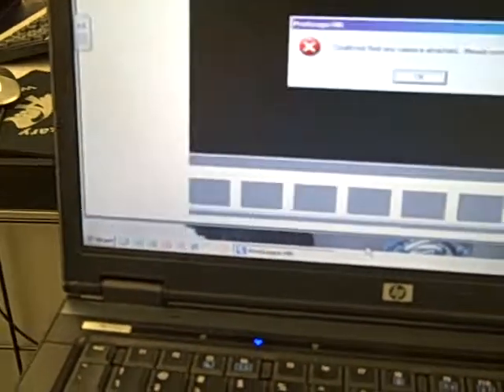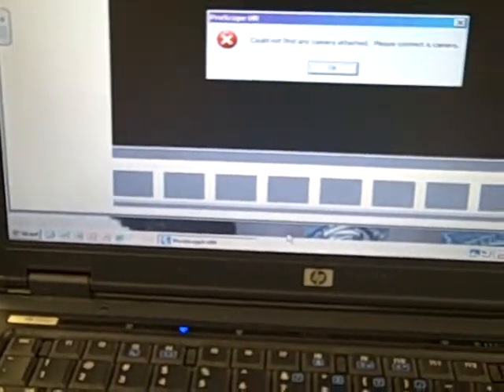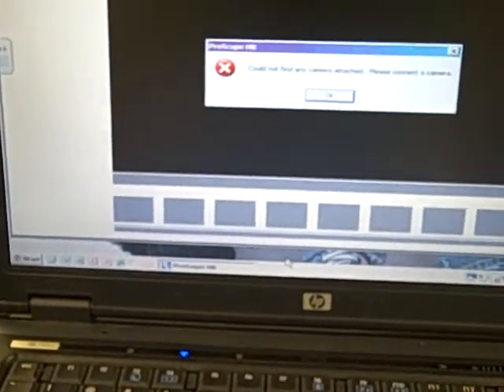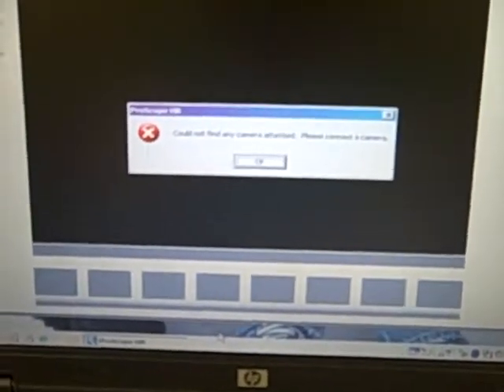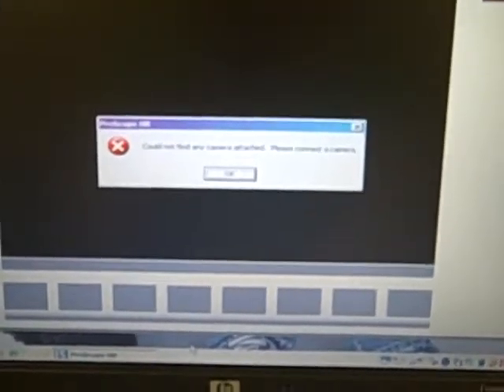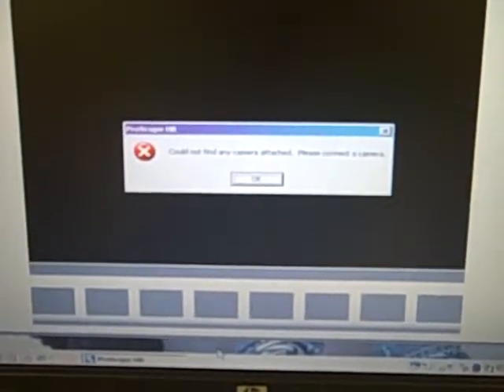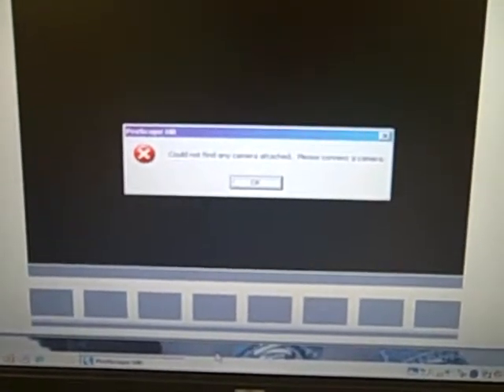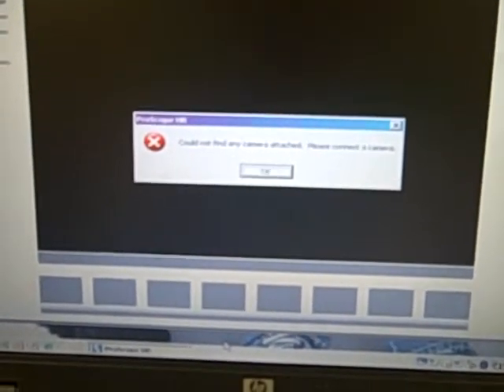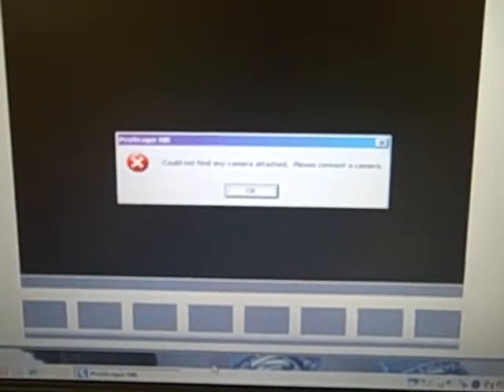At this point, if you get an error, come see me. The one that just popped up right now on mine is could not find any camera attached, please connect a camera. That's a simple thing, just connecting a camera. If your error says something that you need to download Windows Service Pack, email Katie, and I will give you the really quick attachment that you need to run this. It takes 30 seconds to do, but just let me know.